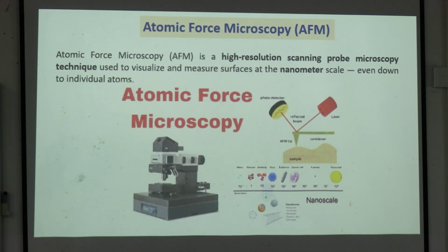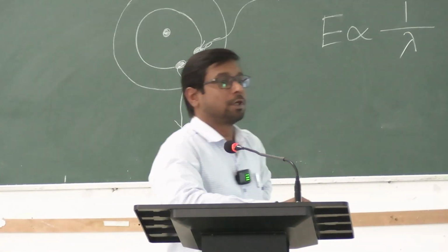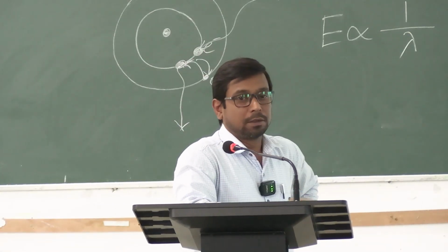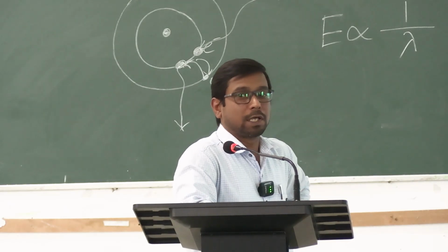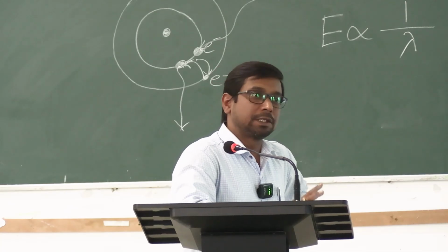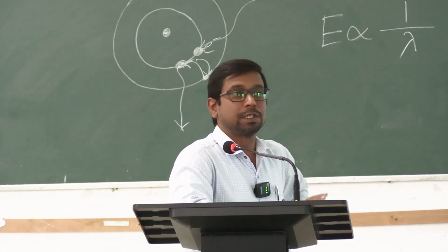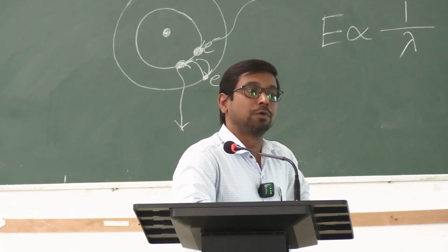If you have any doubt, you can ask. Hopefully you got a little bit of microscopy, and I think light microscopy will help you understand how it is working, resolution, and magnification. Okay, magnification is a part, but resolution is the main thing, and on that resolution only the value of a microscope will be decided.